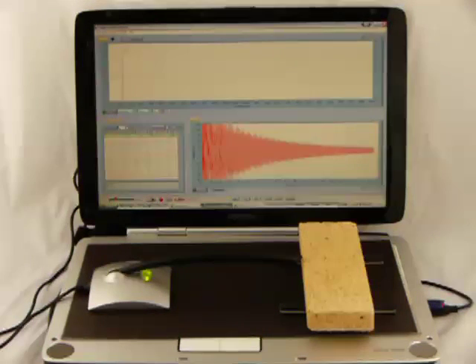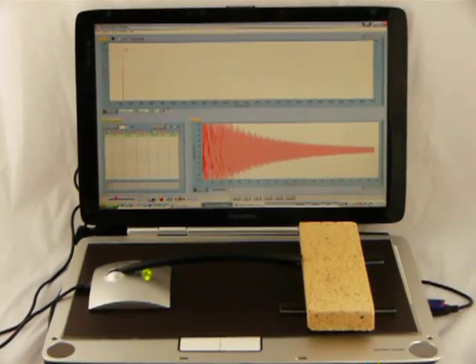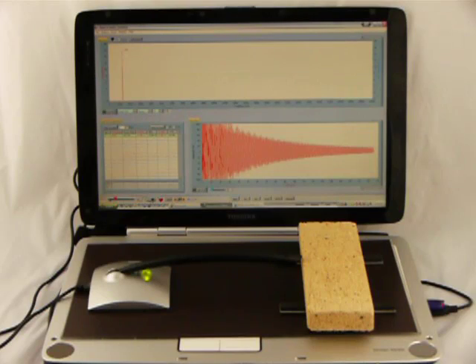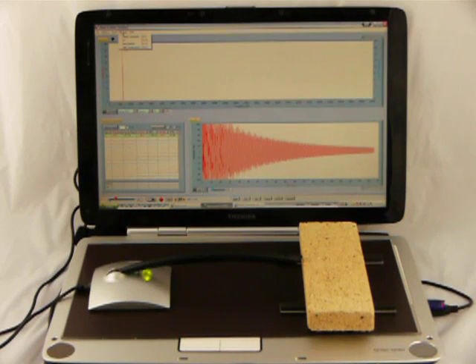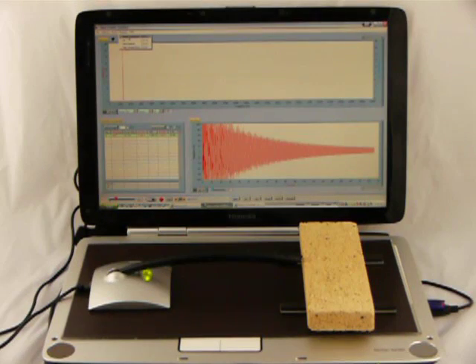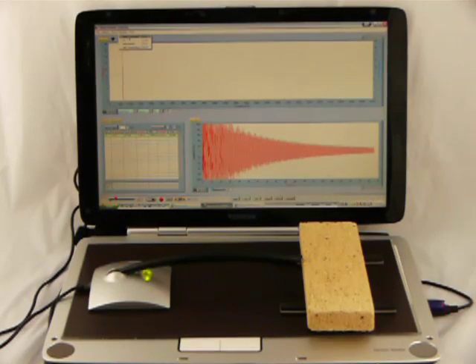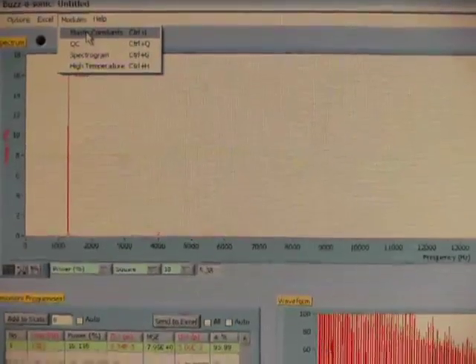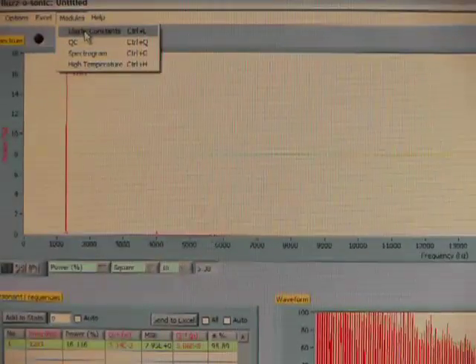Turn this off. Now we can launch the elastic constants module from the menu. Let me zoom in. Launching the elastic constants module.